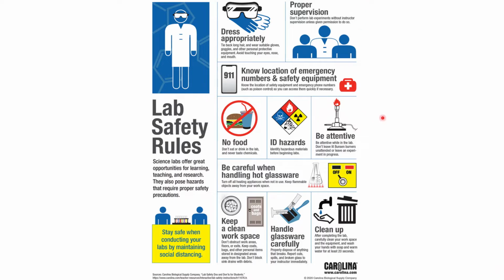Also, no food. You're not allowed to eat or drink inside the laboratory. You also need to identify the different hazards and risks inside the lab. Be attentive at all times. So this means that you have to be alert at all times and at the same time cautious, and you need to have common sense.